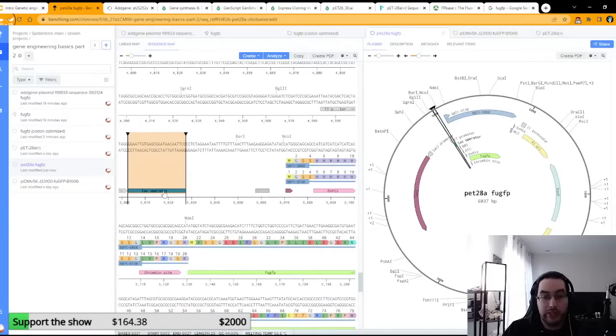What we can do is we can just delete this, straight up. The way that we can do that is, you see there's a restriction site up here called BglII. I call it Bigly because, you know, it's fun. As long as we have a restriction site, it means that we can get rid of code. Because if there's no restriction site, the way that you insert code is just a freaking nightmare, because then you've got to do PCR and Gibson and all kinds of stuff. But we have a restriction site here, so we can actually make this change.